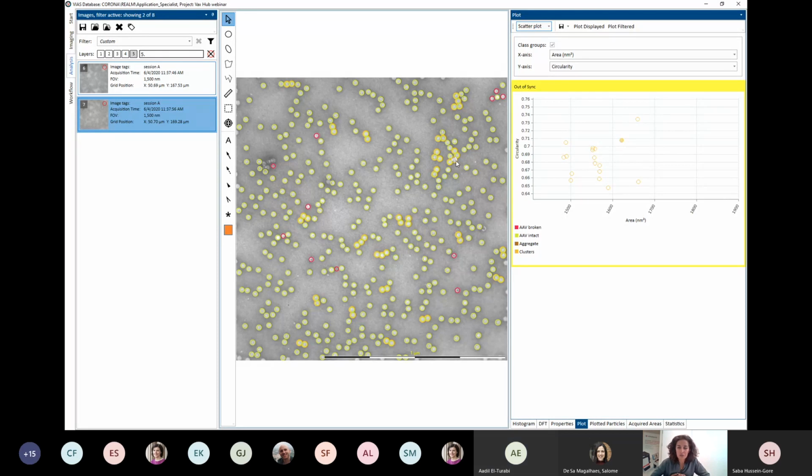We always like to get as much information from the user as possible to look at these kinds of links. It's more that they come to us with other techniques that they have used and say, here is a purification that I'm doing, but I'm getting 2 peaks, and these 2 peaks behave exactly the same, but they come out at slightly different size. I've tried different things, but I want to know, is there something here that is different? Is the size distribution of these 2 peaks different?